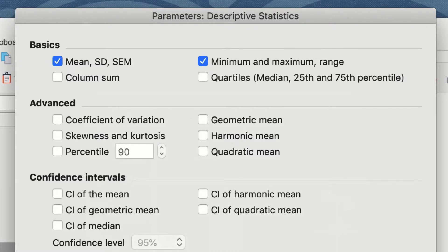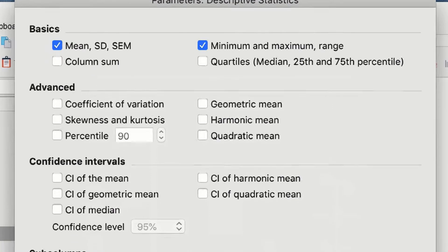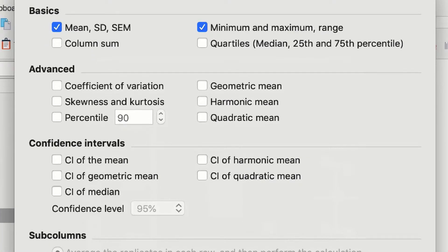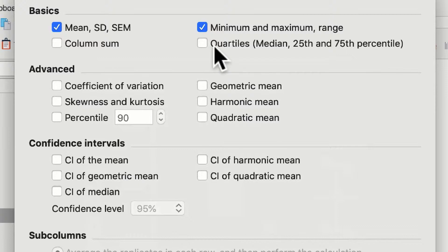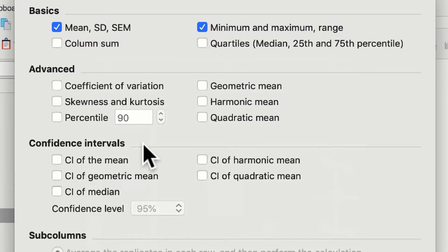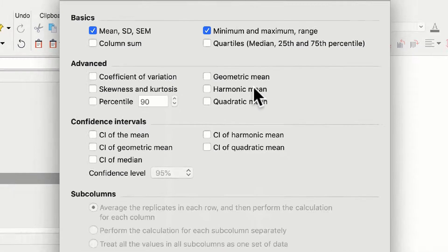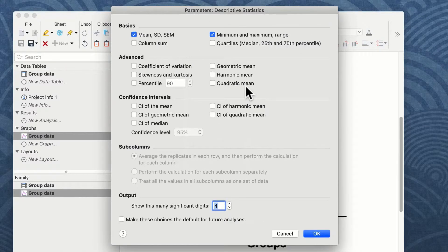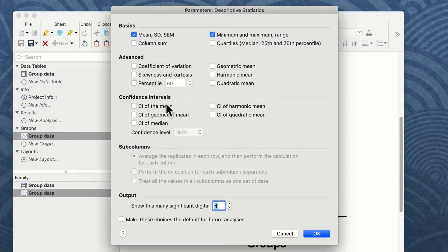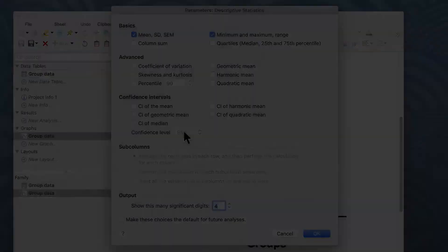In addition to these basic options, you have a number of other options including the sum of your columns, the quartiles, and in the advanced and confidence interval option you can look at coefficient of variation, geometric means, harmonic means, quadratic means, and in the confidence intervals you can look at confidence levels set at whatever level you want to set them at.